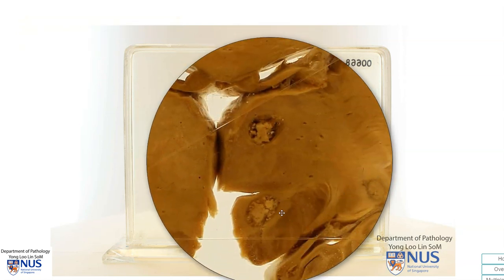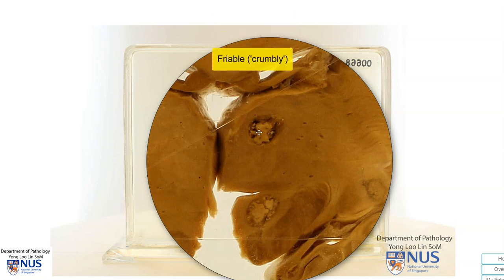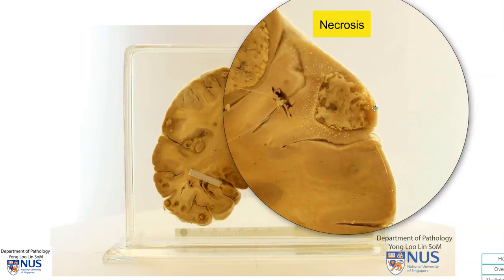We can see, for example, in this particular mass, it is relatively well demarcated from the rest of the brain parenchyma, and in this central region there is a pale geographic area which is quite friable in appearance. We see a similar appearance here, and this most likely represents necrosis. Again, we can see this geographic area of pale necrosis within this mass.